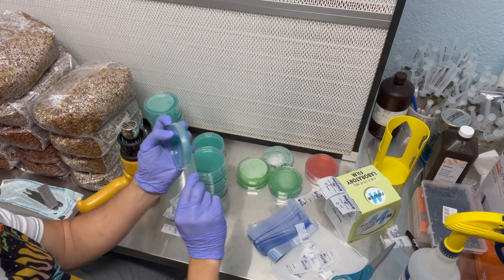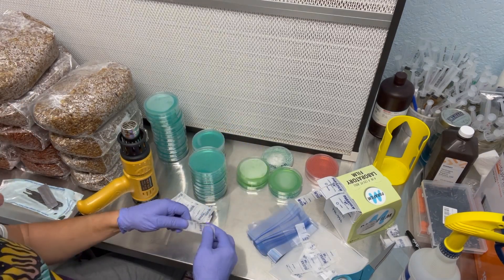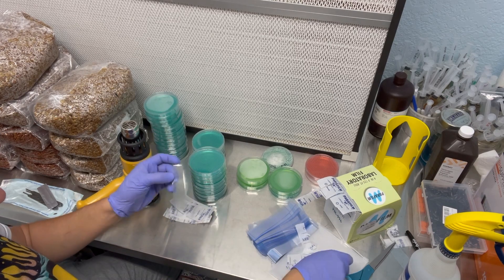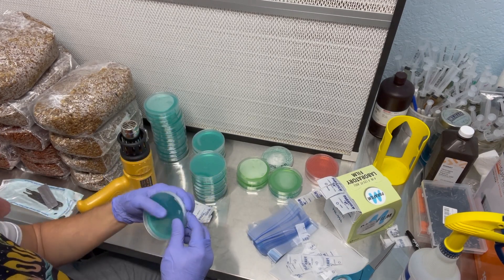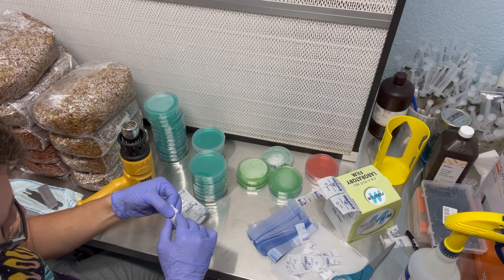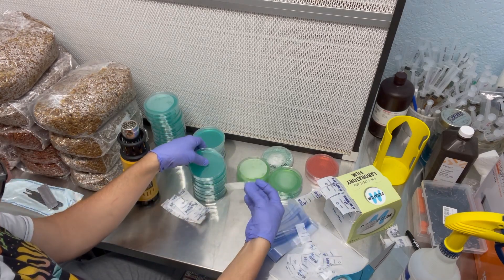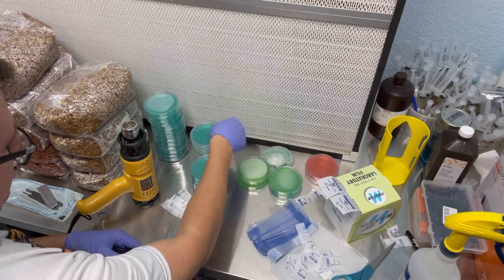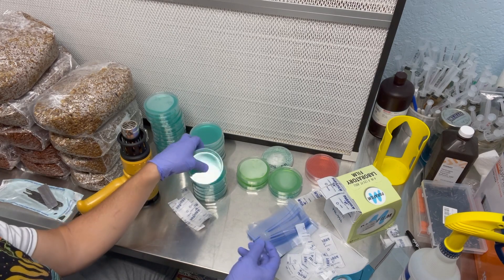In order to use the shrink wrap, you have to have enough space for the heat gun — so that could be a downfall if you don't have as much workspace. Also there's quite a bit more dexterity involved when you're doing the parafilm. It's definitely more of a skill.